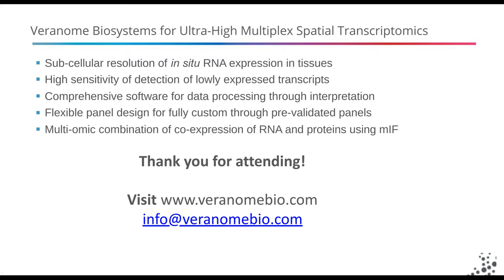Great, thank you so much. And Chris, I believe you may have had a comment for the audience real quick. Sure. We've got a number of questions asking about the overall throughput, image area, as well as the sensitivity of detection. Rather than answering each one of them, I might just tackle them all in one answer, because there's a lot of repeat questions. In terms of the sensitivity, we're on par with single molecule detection associated with standard smFISH.